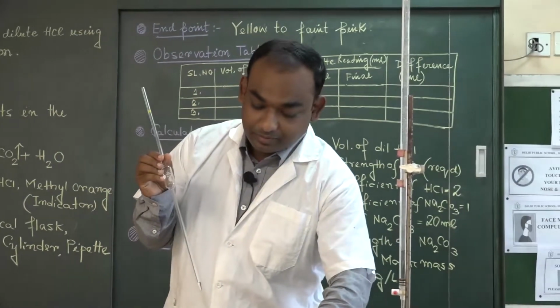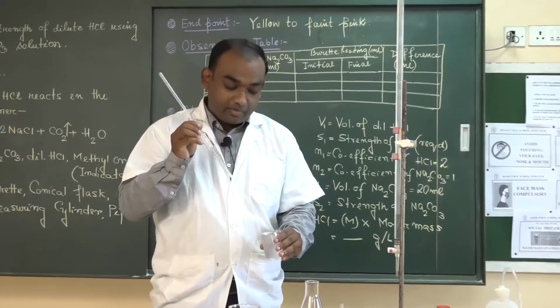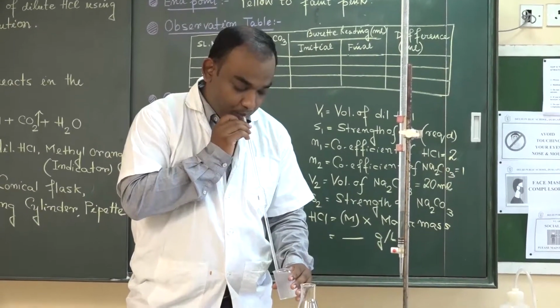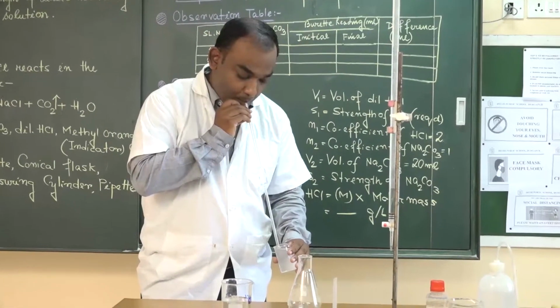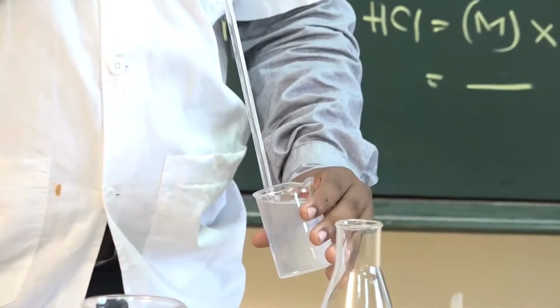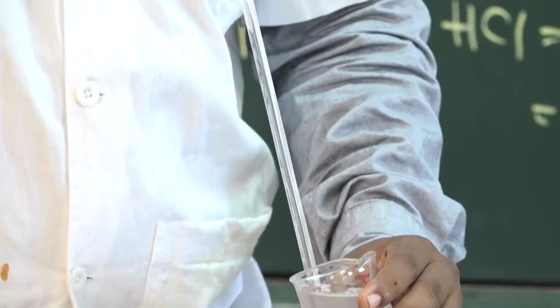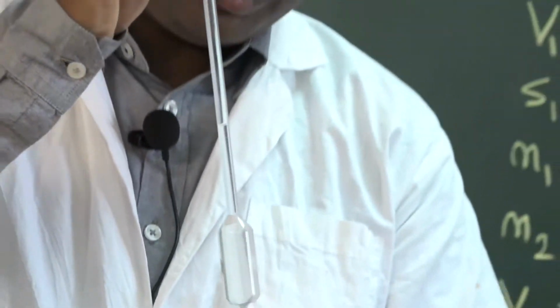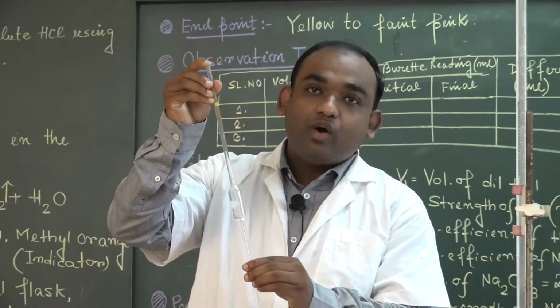Okay, students. We are pipetting out sodium carbonate. So students, now we are pipetting out 20 ml.